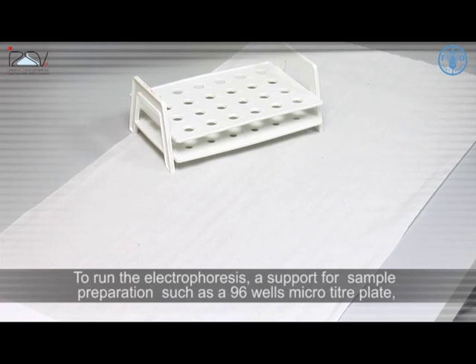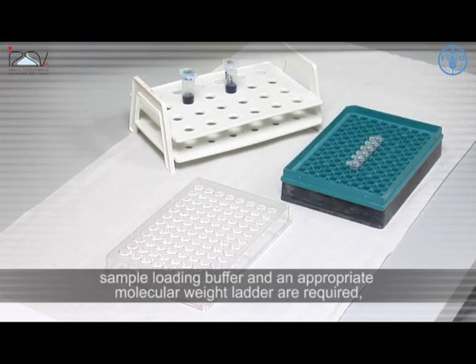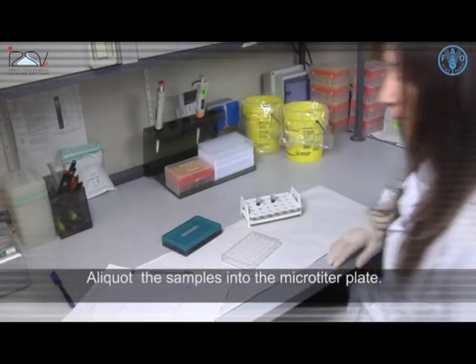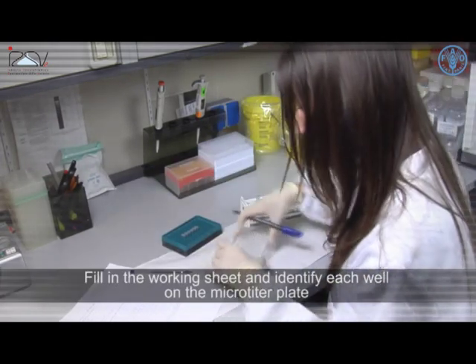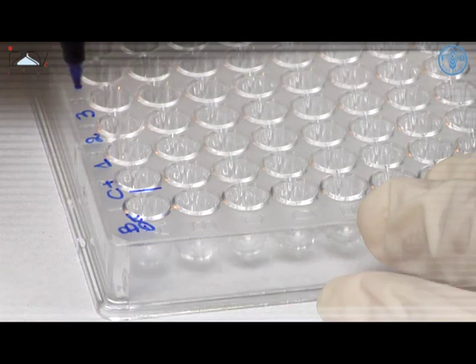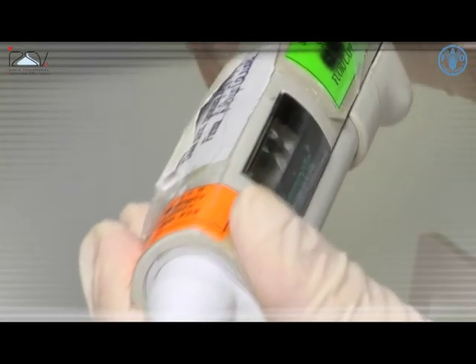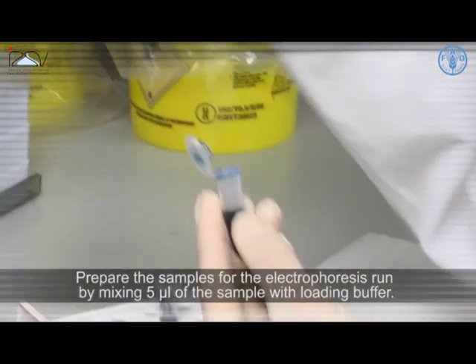When finished, dispose of any tips or gloves that have been possibly contaminated with ethidium bromide correctly. To run the electrophoresis, a support for sample preparation such as a 96-well microtiter plate, sample loading buffer, and an appropriate molecular weight ladder are required, as well as the DNA samples. Aliquot the samples into the microtiter plate, fill in the working sheet, and identify each well on the microtiter plate with the corresponding sample identification number.